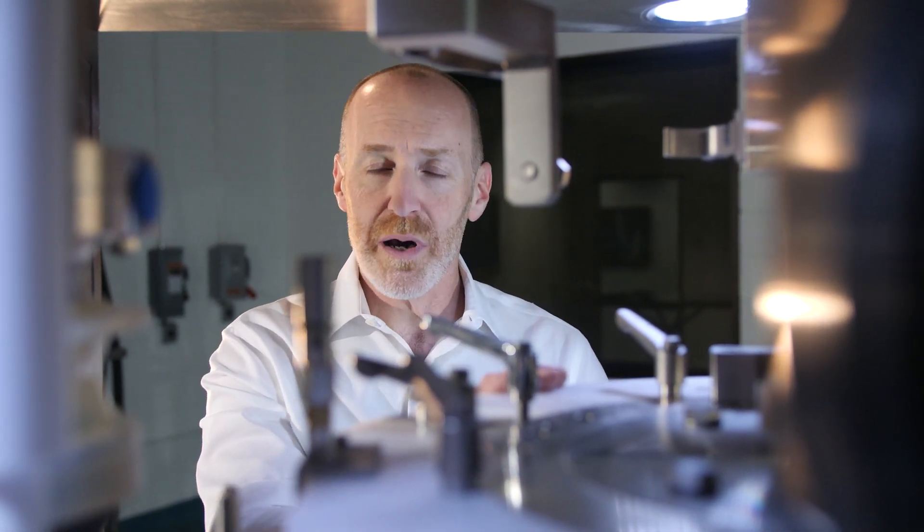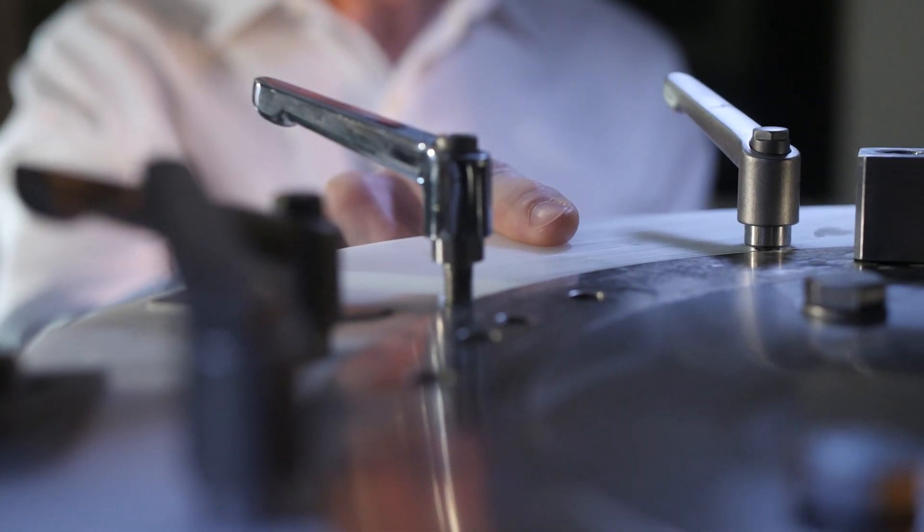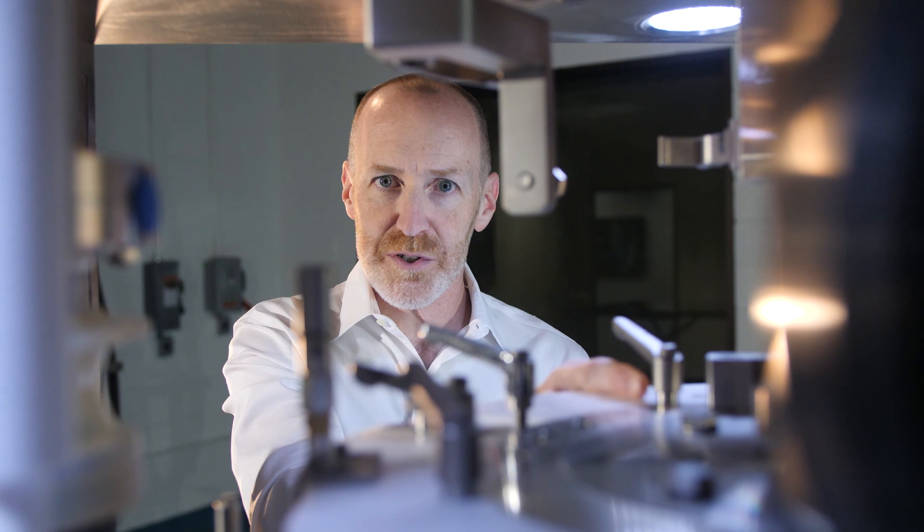Most modern tablet presses do utilize some system for monitoring upper and lower punch tightness in an effort to minimize damage to other components. Many systems, however, rely on a fixed position sensor where the offending punch must occur at a specific spot in order to prevent such damage.